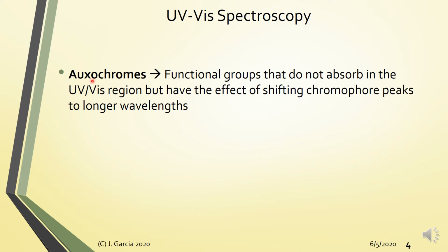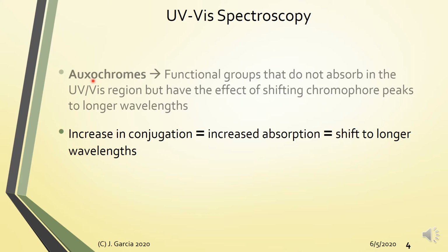There will be a shift in the wavelength of absorption, okay? So, in general, for conjugated compounds, as you increase the conjugation length, ibig sabihin yung gaano karami yung pila-pilang double bond, single bond, double bond, single bond conjugation. Alright, so ano effect nito?